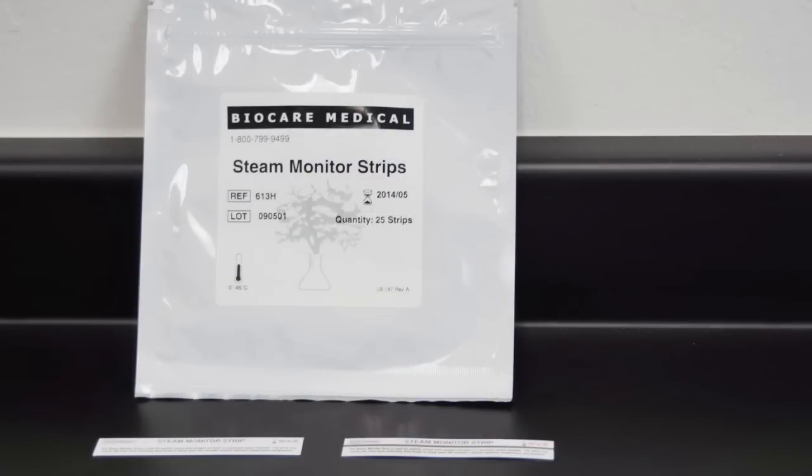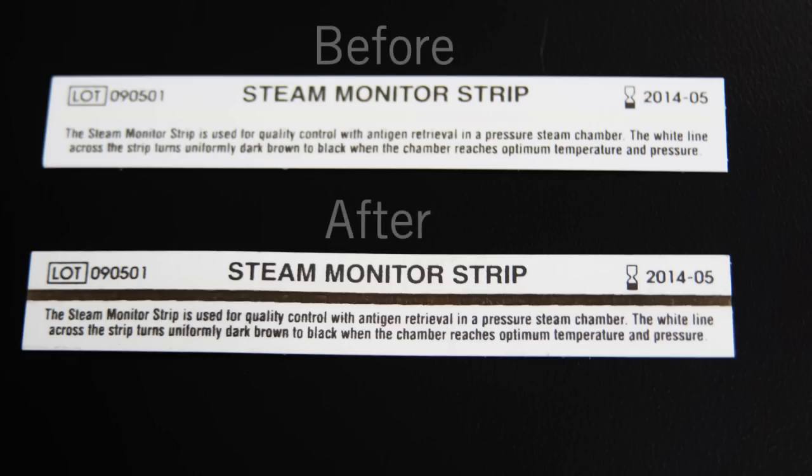In addition, the use of steam monitor strips with runs at 110 degrees Celsius provides confirmation that appropriate heat and pressure levels were reached inside the unit.